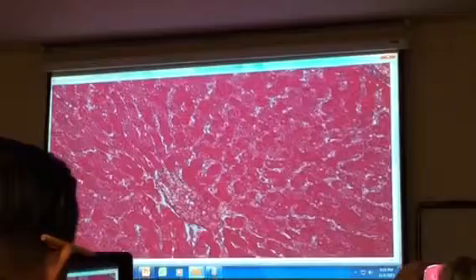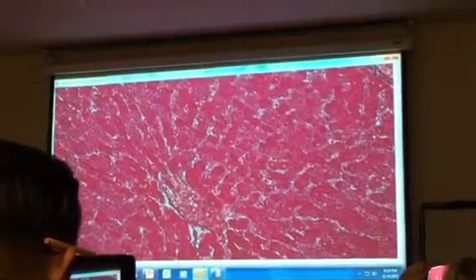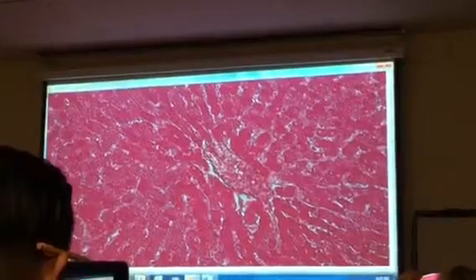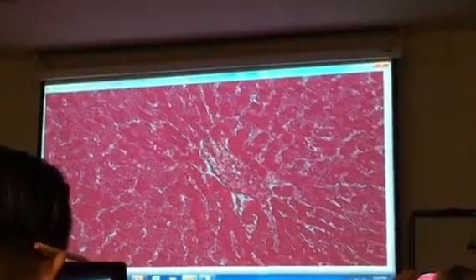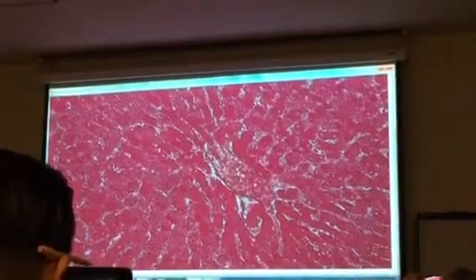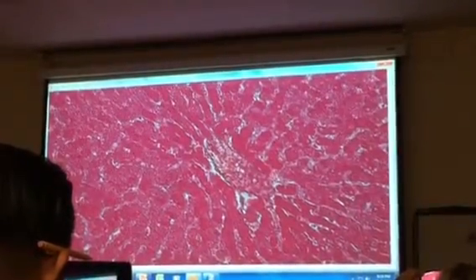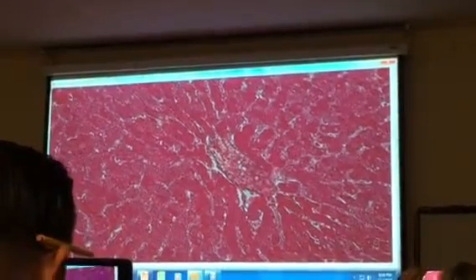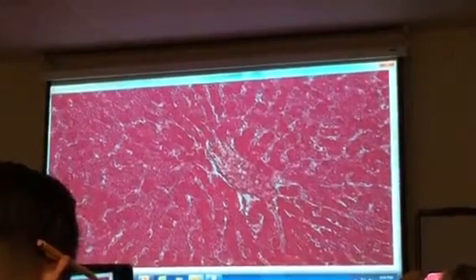You can see the nuclei of the hepatocytes kind of stand out, those little tiny circles. Here's your central vein. Here's the hepatocytes. You can see some white spaces in between, mostly white, I guess, not all. Some spaces in between, kind of little snakes or little streams.